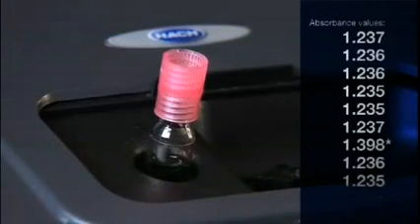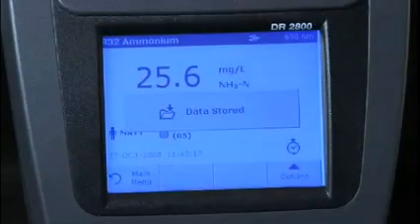On the second spin, the instrument takes ten readings, rejects any outliers, and displays the average on the screen.